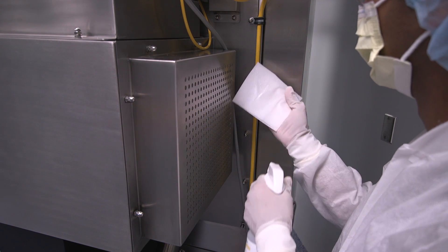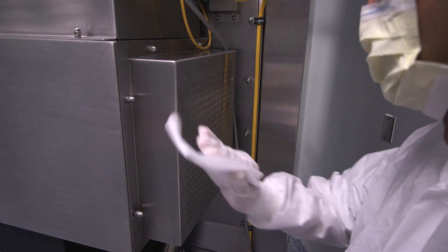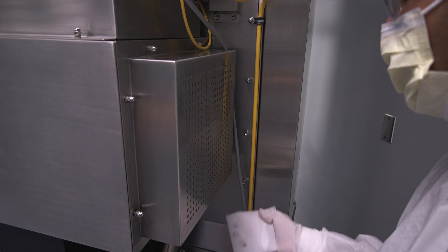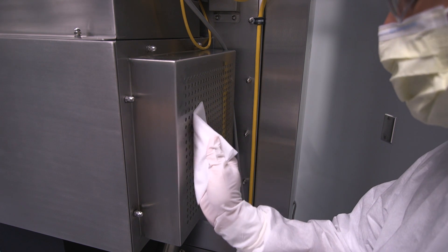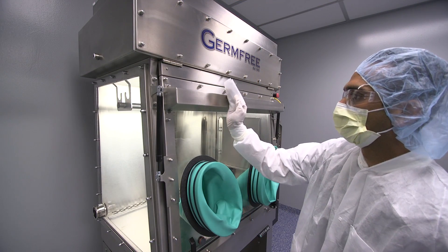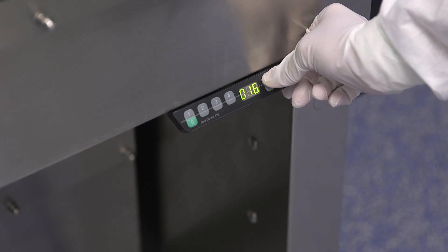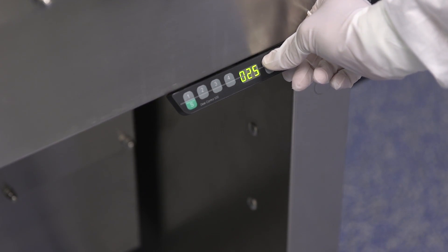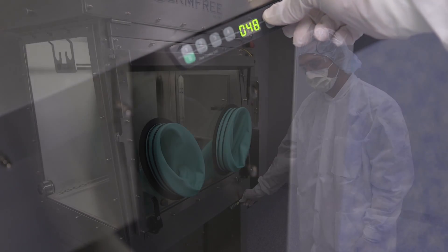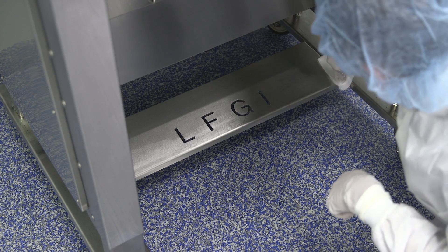Begin cleaning the LFGI by starting at the top of the unit. When cleaning the pre-filter at the top of the unit or any other HEPA filter on the LFGI, do not spray a cleaning liquid directly onto the filter. Saturate a wipe with disinfectant or sterile alcohol, then wipe the pre-filter. Clean each outside surface. The entire cabinet can be raised or lowered with the controls on the right side of the machine. Raise the stand at least three inches to make it easier to reach and clean the caster cross supports.